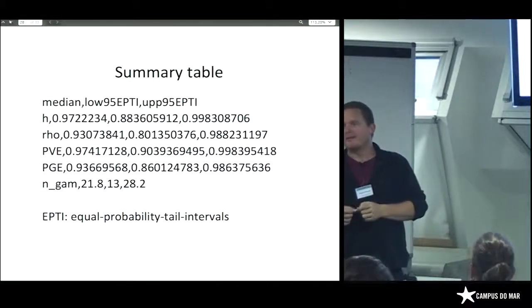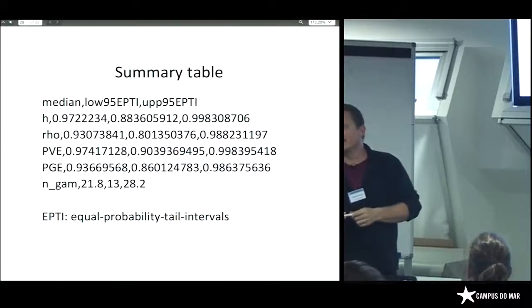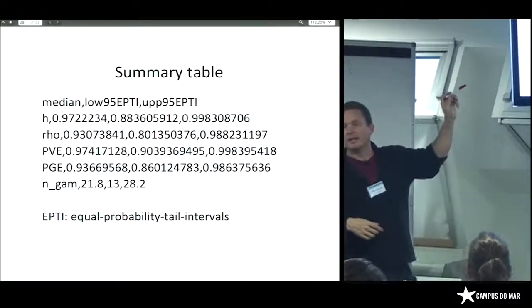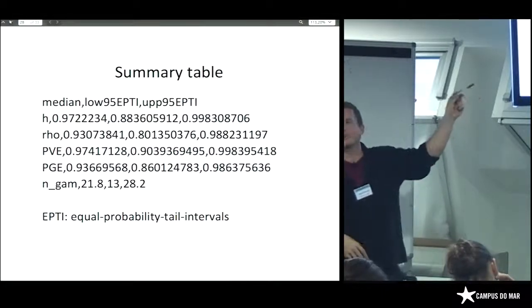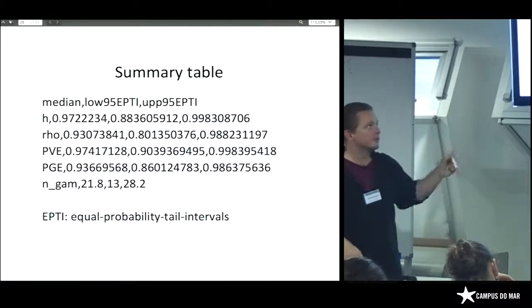And normally, if that number is somewhere in the 40% range, it's probably getting close to reality. And in those other parameter files, the gamma and the BV files, you can actually get the estimates for individual SNPs, and they're listed in exactly the same order as the SNP location file that you generate at the same time.